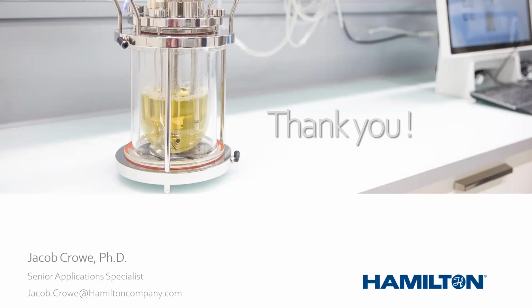Do you see any advantages to combining the information from this sensor, live and dead, with capacitance, only live cells? Could these sensors give you a combined read on viability? The answer is absolutely yes. So that is one of the ideas we wish to push, and the ideas we are pursuing is that if you have a measurement of TCD, that is VCD plus dead cells combined, and then you have a measurement of VCD, that is viable cells only. With the proper model building, it is very much within the realm of possibility to get an estimation of viability throughout the duration of a run.